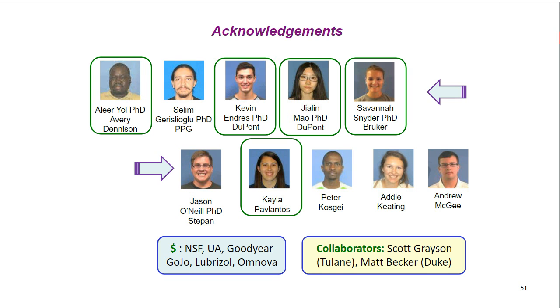Whether a polymer breaks or not depends on whether you put in enough energy to equal what's needed for the dissociation energy. And so for larger polymers, you need to input more energy to accumulate enough energy to dissociate them. In some cases, it's more difficult to fragment larger polymers when they're singly charged. So, to simply summarize your question, which is a very important question, usually what you see is all molecular ions. And so if you don't see a Gaussian distribution, it means that the polymer is not of narrow molecular weight, of narrow polydispersity. It's broad, and that's why. It's not because it's fragmented. Actually, in that case, you can use electrospray or another method, and you can confirm what I just said.